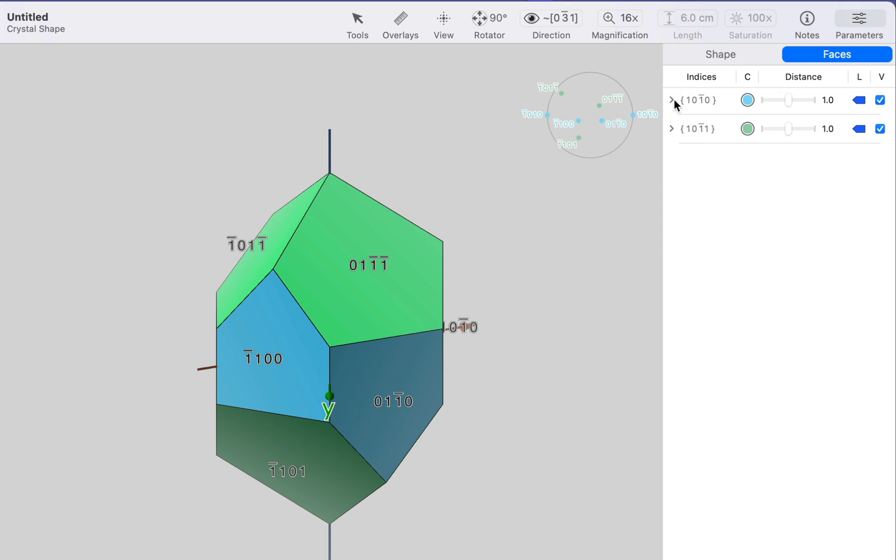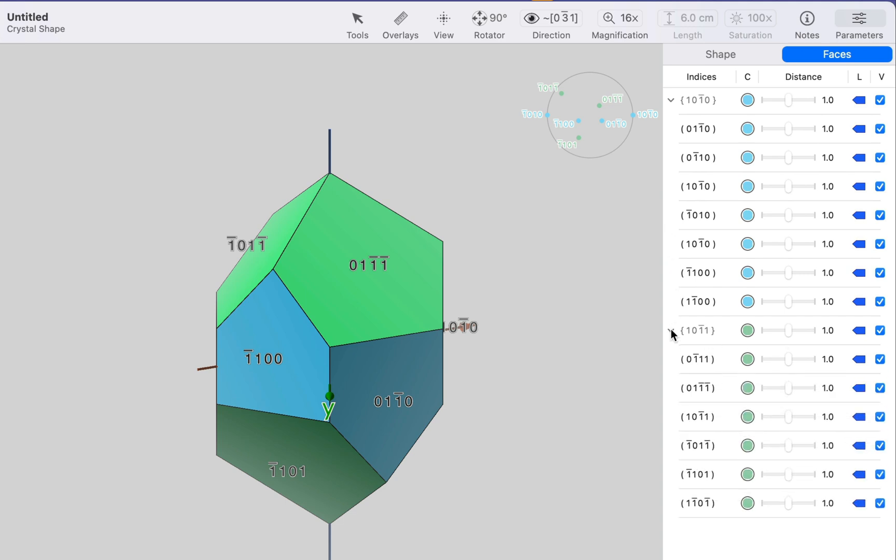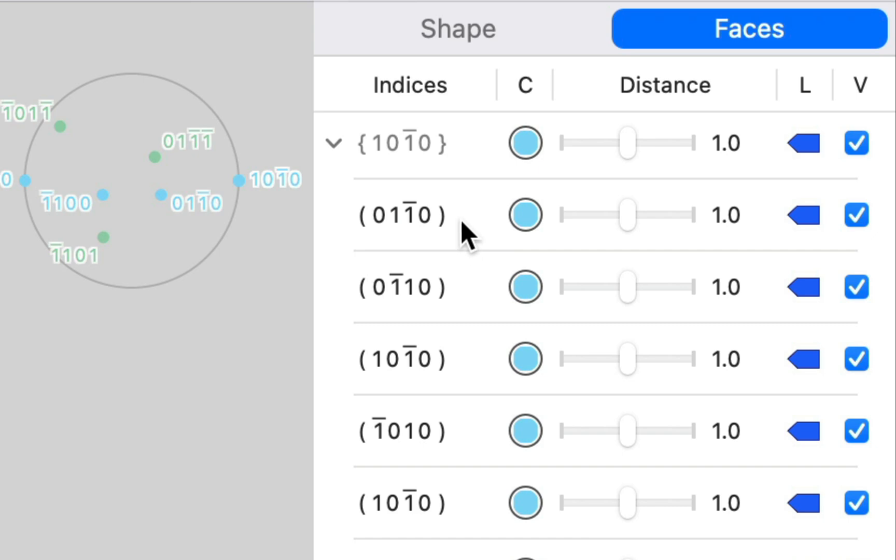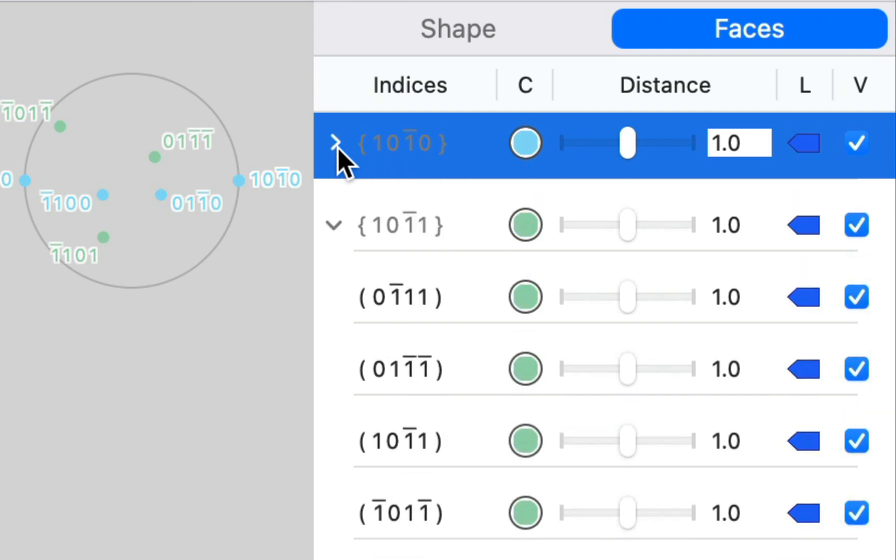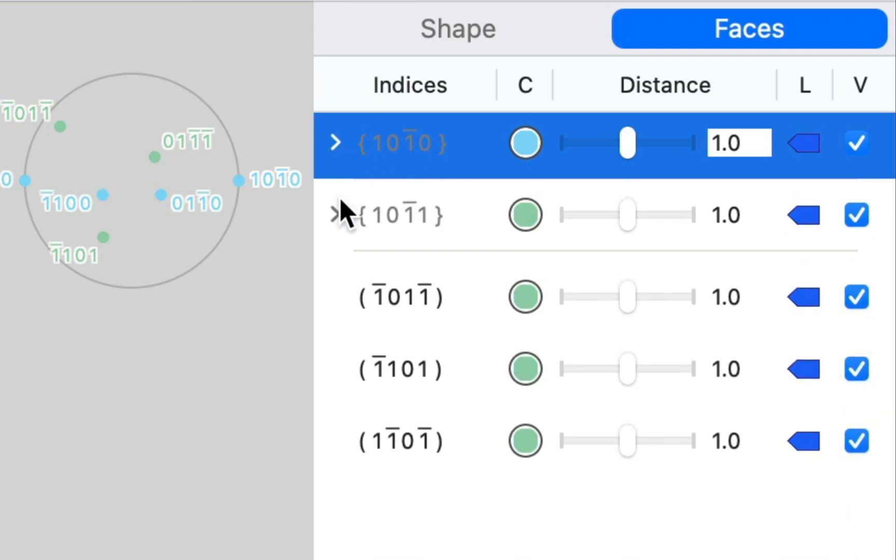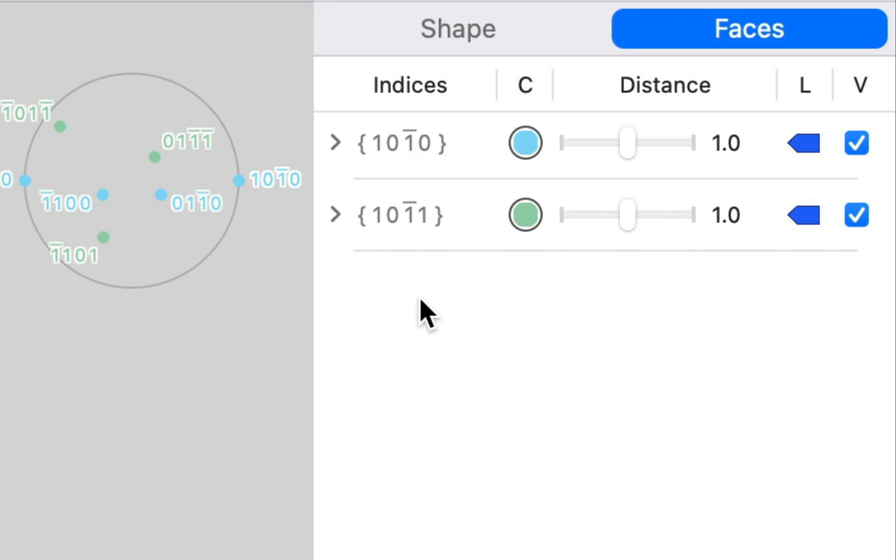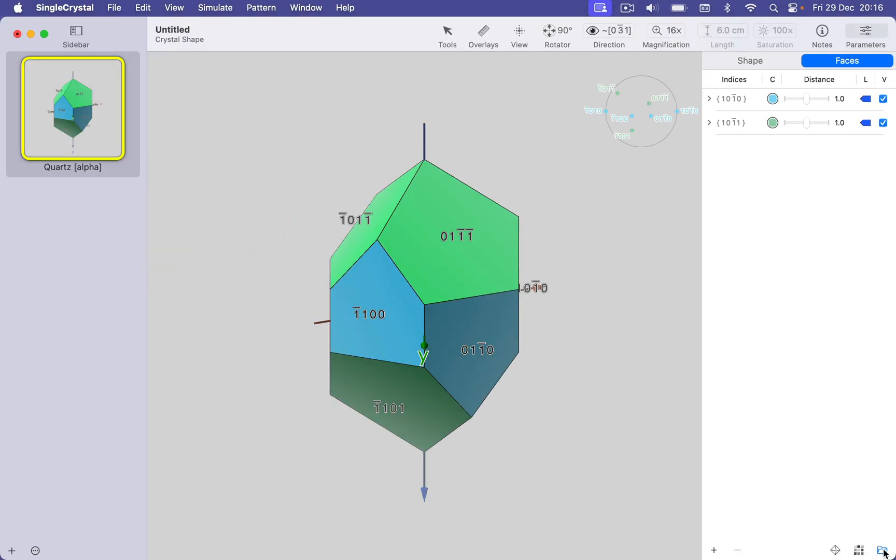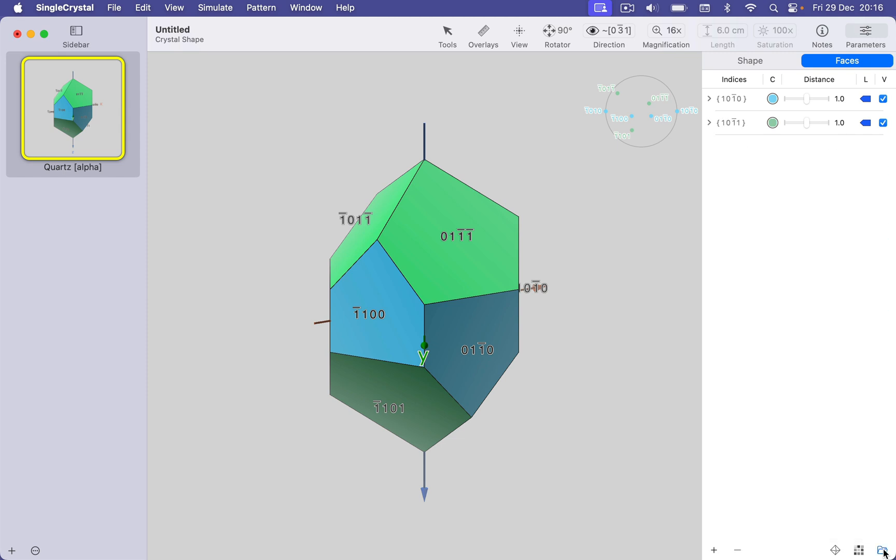Now if we expand these groups, you can see that these are the individual planes that are related by symmetry. Individual planes have these curved brackets. The group rows have squiggly brackets. This is a crystallographic convention. Squiggly brackets means a crystal form. That is a set of faces related by symmetry. And we've got the group by symmetry option down here. We can toggle that on or off.